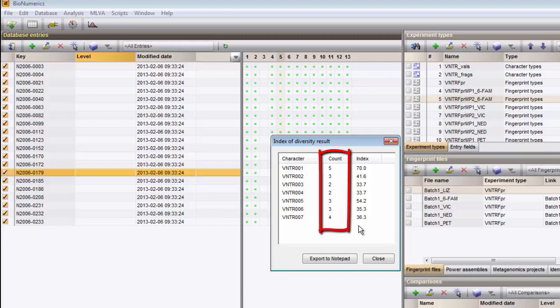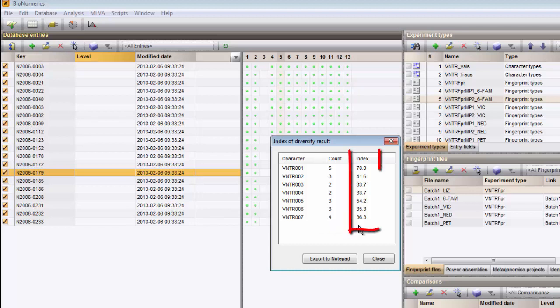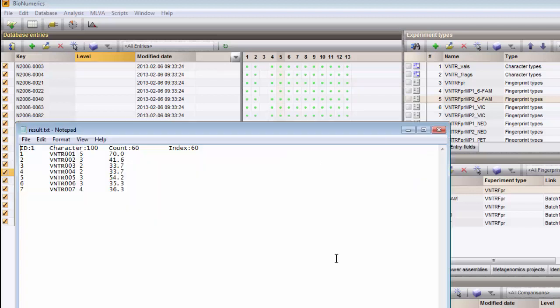The resulting report displays for each VNTR the number of different categories detected and the Index of Diversity. This list may be exported to a text file.